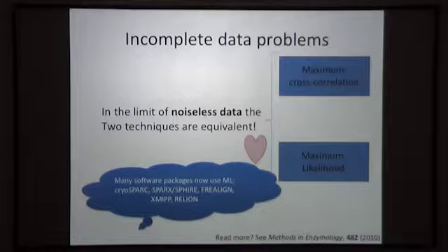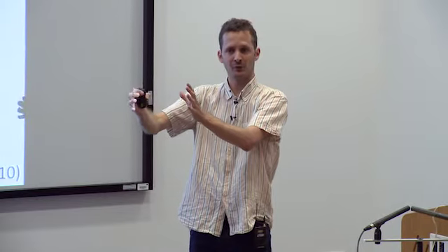Anyway, I think it's quite interesting. And at the Gordon conference last week, we heard that also cryoSPARC, this new thing around it, uses maximum likelihood. Nikolaus Grigorieff implemented maximum likelihood in FrealignX. CryoSPARC uses the same regularized likelihood target as in RELION. So it's interesting to see that the whole field is moving towards these more statistical approaches, very much in line with what the crystallography field did, I guess, during the 90s.